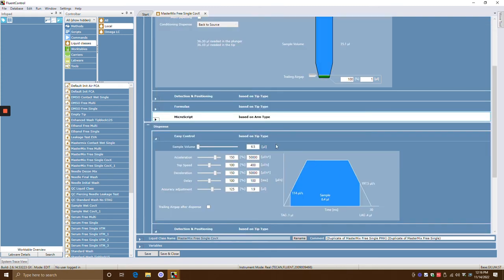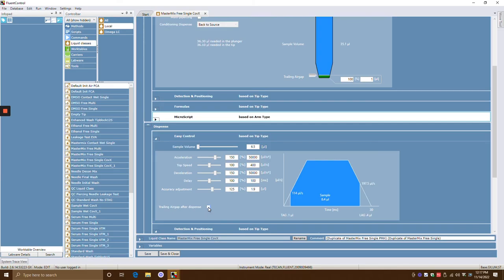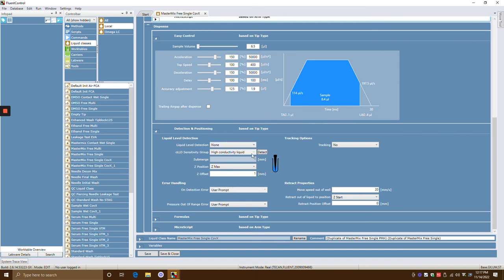Now let's get into the dispense section. This shows an example of the sample volume. Acceleration is how fast you want to dispense — this is the top speed. You have a trapezoid shape: acceleration, a plateau, and a deceleration. The reason to change acceleration speed is similar to drinking out of a straw — if you drink too fast, you pick up too many bubbles. If you decelerate too fast, you get too much residual volume. You're just tweaking parameters to avoid introducing bubbles and ensure you're aspirating and dispensing everything correctly. The trailing air gap after dispense is the blowout — you can click that if you want blowout. And the detection and positioning parameters are the same as in the aspirate section.